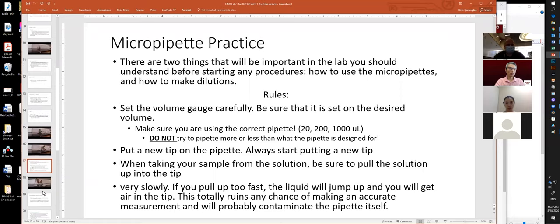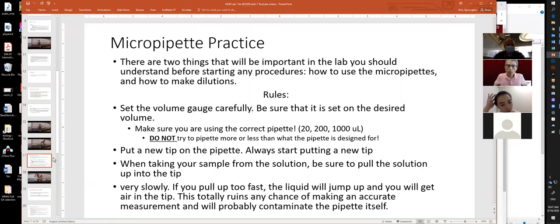So, micropipetters. Particularly when you do experimental approaches, whether you are in a microbiology lab or an ecology lab, most likely you will be using micropipetters, particularly for handling small volumes such as 1 micro, 10, 100, 1,000 micro. I think a vast majority of you probably have practiced, but rarely. I have some students who have never used micropipetters.